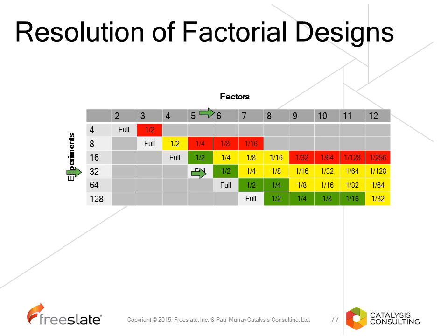We're running half of the experiments because we would have been running 64 experiments if we looked at all of the experiments. In a half factorial, this is a resolution 5 design, and a resolution 5 design enables us to look at all of the factors and the interactions and understand them.